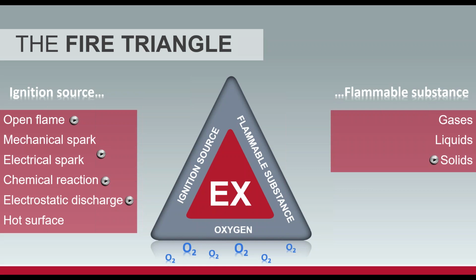Again, think about now in your design how you can segregate these things from getting to the flammable substances, which we all know are going to be prevalent in the laboratory. And ultimately oxygen, if we get rid of that, we got a bigger problem. Right? So we can control the ignition source. We really can't control the flammable substance. Our process is trying to get less of that. You know what, I'm wrong. We can control that flammable substance because we can segregate that. We can store it properly away from those other ignition sources. So we can keep that apart, and that's really the segregation that can help us.